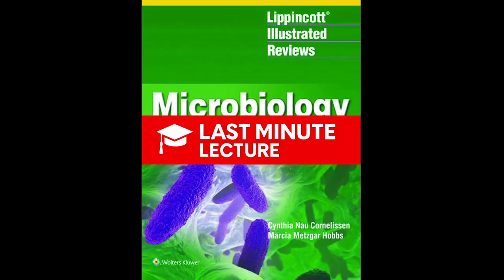Very clever. And the last type is differential media. This one is about color coding. And the king here is MacConkey agar. It's a workhorse. It does two brilliant things at once. First, it kills most gram-positives, so if something grows, it's almost certainly gram-negative. So it's selective first. And then it's differential. It asks one simple question. Can you ferment lactose? And it shows the answer with color.